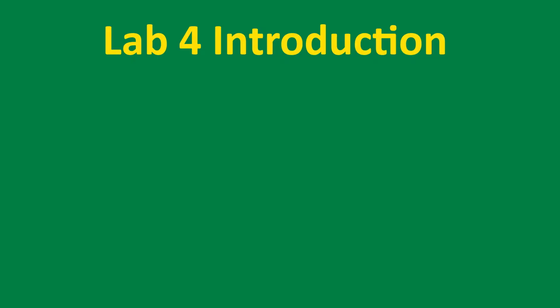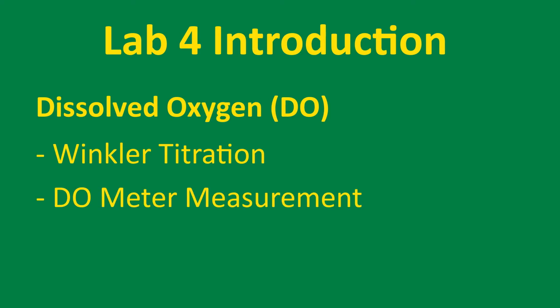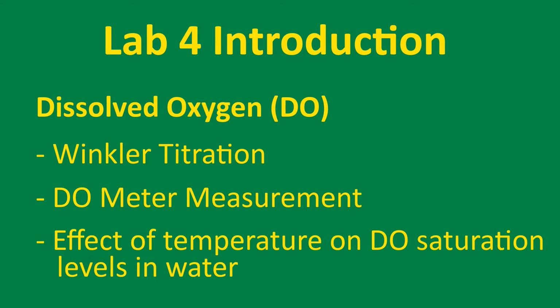Hello everyone. In this lab, we will learn how to determine the dissolved oxygen (DO) using both the Winkler titration and DO meter measurement. We will also study the effect of temperature on DO saturation levels in water.